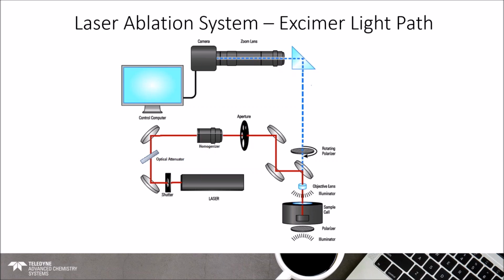The way that we do that is we actually take the beam, we split it apart into a lot of small beams, and then put it back together. And that works very, very well. The result of that is that you end up with a perfectly cylindrical, flat-bottomed crater, which is extremely important for the technique. If you didn't, because the beam would be hotter in the middle, you'd actually end up with a conical shaped crater instead. And that makes a lot of this quite a bit more challenging.